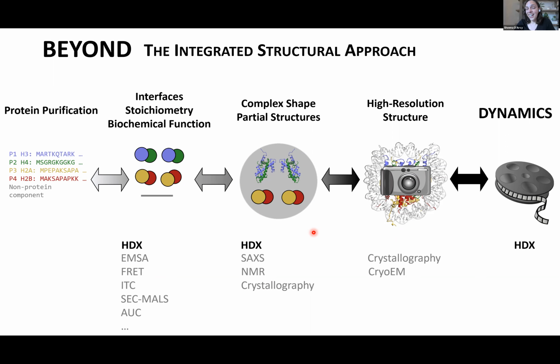However, over the last 5 years, as now my lab has its own HDX system, we have really come to appreciate that while HDX is really, really useful in the integrated structural approach, what it does is give the integrated structural approach a whole extra element.